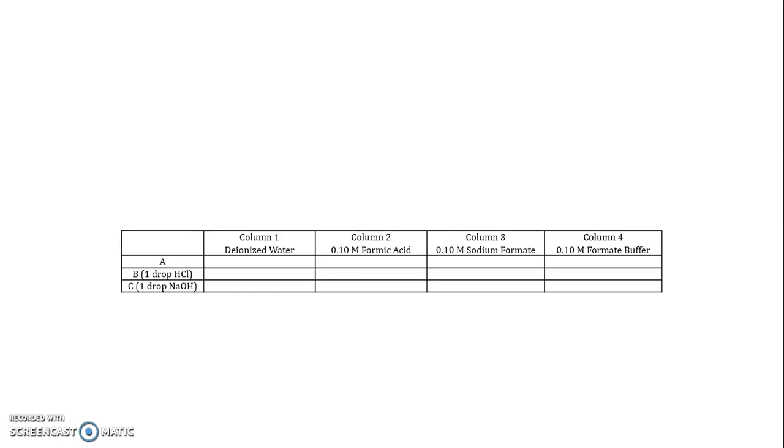And so here, we'll take the time to simply present to you the results that were obtained when I measured the pH for the various solutions. First, I have a pH of 5.76 for the deionized water. Again, reflecting the fact that the water has some carbon dioxide dissolved into it, which forms carbonic acid, the deionized water has a pH below 7.